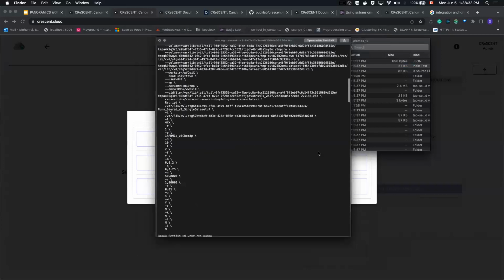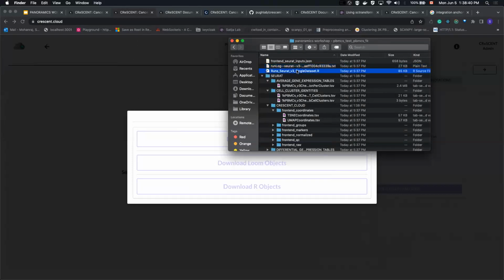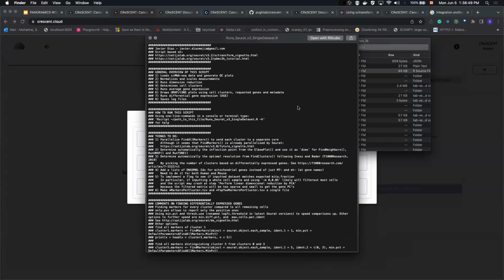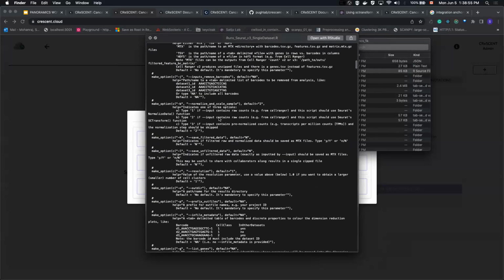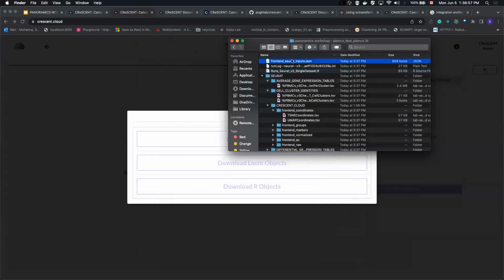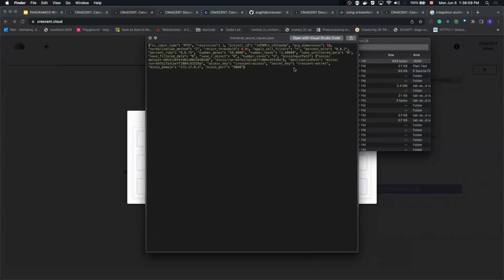Yeah, so exactly. We include the script that we ran in order to actually get all this data out. So in the download itself, you get this R file, and it basically tells you where this is coming from, the resources, and what did we run. And you also have the parameters that you've passed into this. So that's how we did this whole workflow management part.